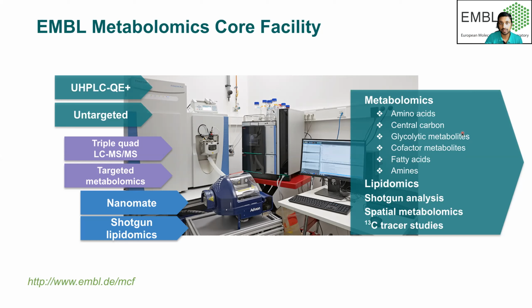But what is interesting, particularly in plant science and also in animal science, where it is interestingly coming up, is that you can track metabolism using labels, such as 13C or deuterated compounds. If you feed them to the biological system, you can actually track how they get metabolized, which is called a 13C tracer study. Or if you do it in a time course and find out the flow of metabolism, that is called fluxomics.